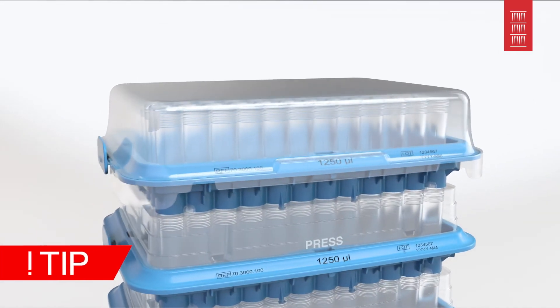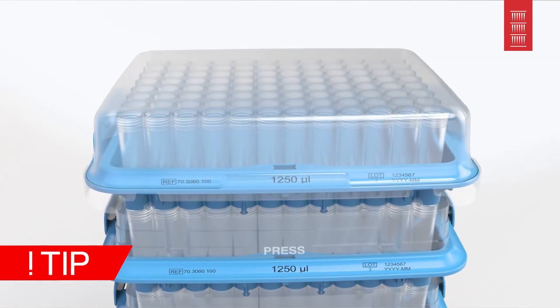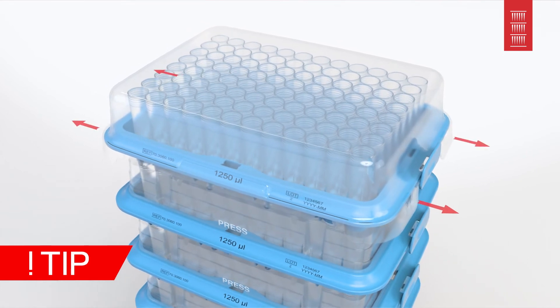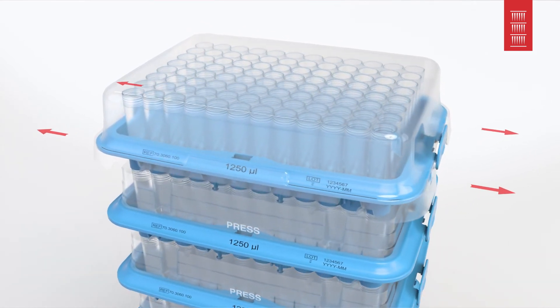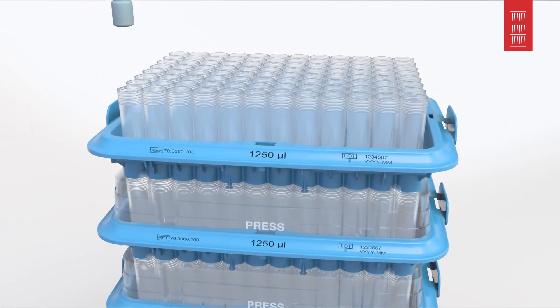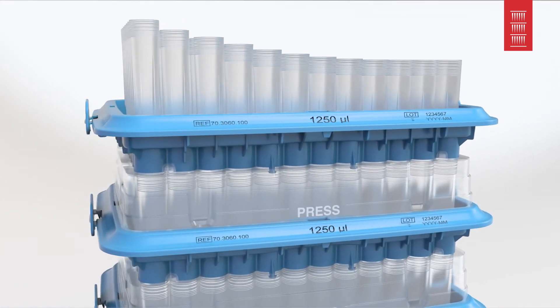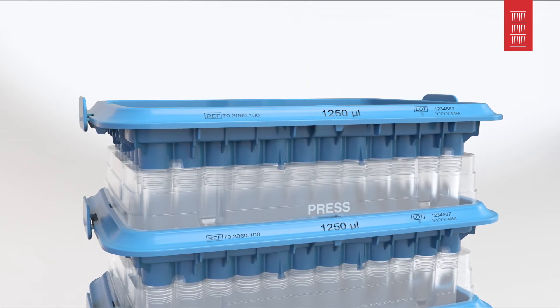Did you know that you can also remove the tips from the StackPak if you are in a hurry? Simply release the cover at the two hold points on the sides, lift and get to work. If you cannot work directly from the StackPak, you can also transfer the individual trays to the box.